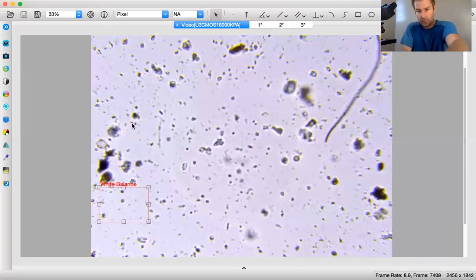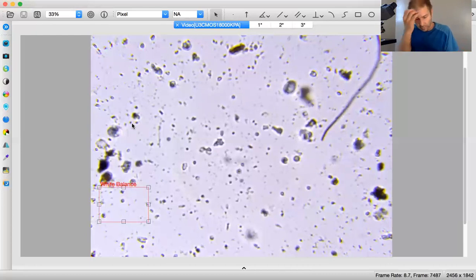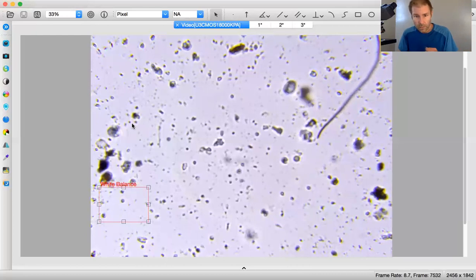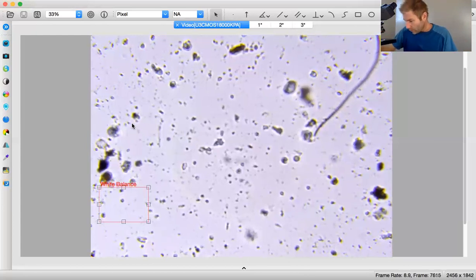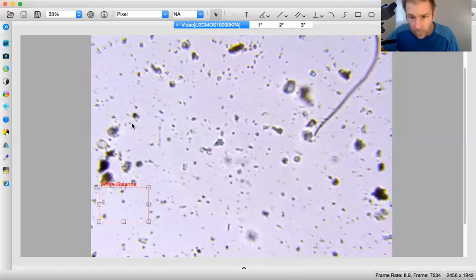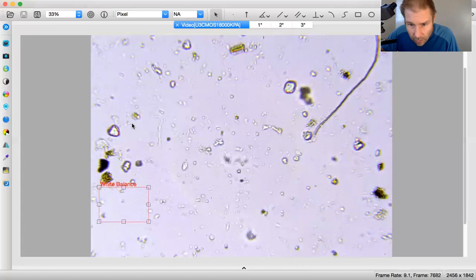So I want to say that's about 1, 2, 3, 4. I want to say that's about 4. So that would be a 0.4 on the length. 4, and for the width, going with a 1.5.